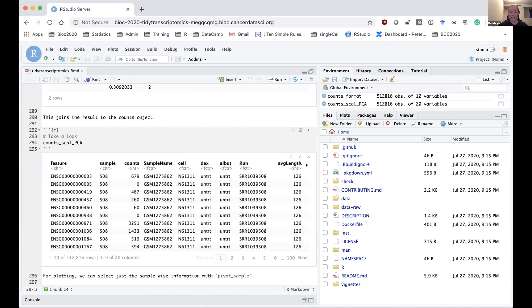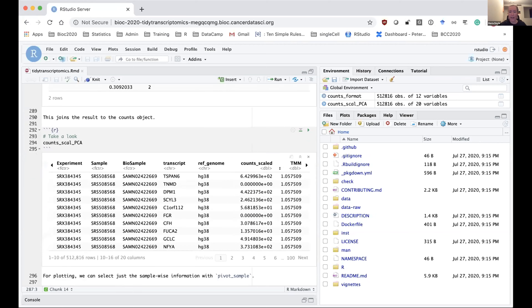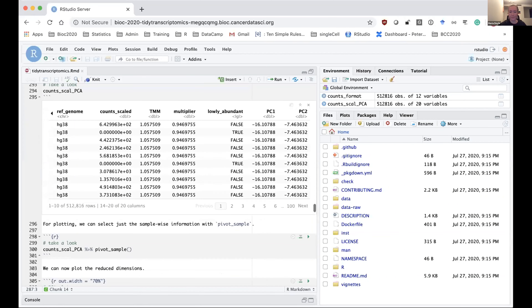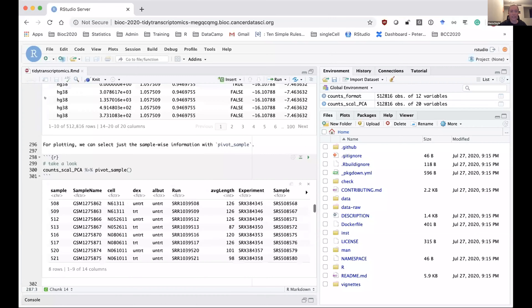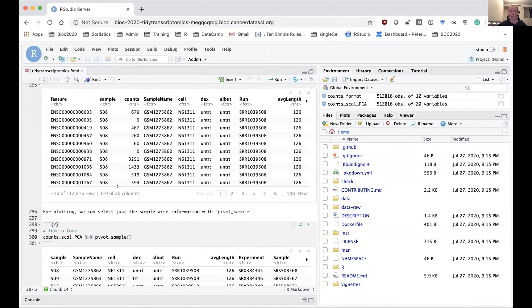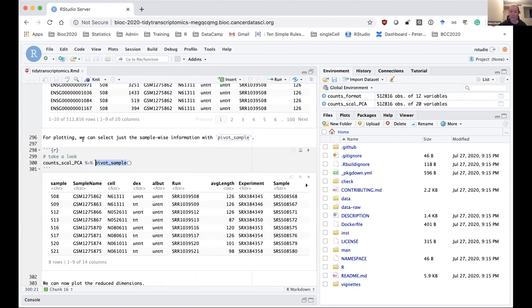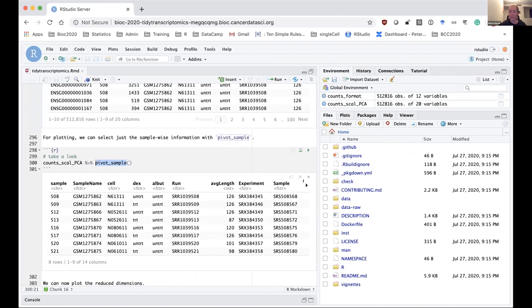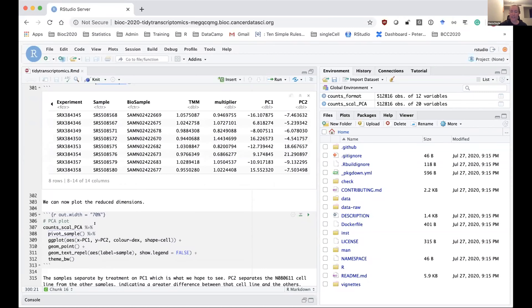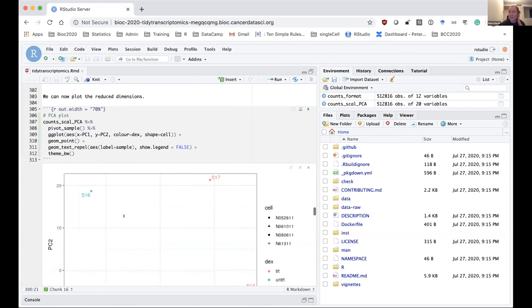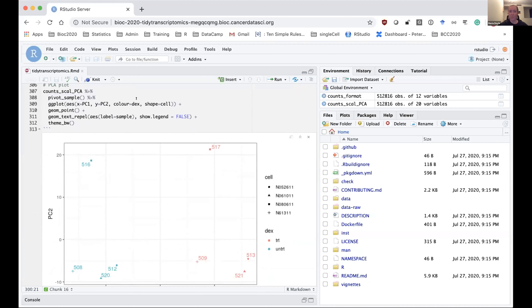We still have our original table in tidy data standard format, with two additional columns added at the end for PC1 and PC2. However, this has one row for every gene and every sample. If we just want the sample information — one row for each of the eight samples with the PC information — we can use tidybulk's pivot_sample for that. We can then take that information and pipe it into standard ggplot syntax to create a scatter plot and produce the PCA plot, coloring samples by whether they're treated or untreated using the dex column, and using different shapes for the different cell lines.